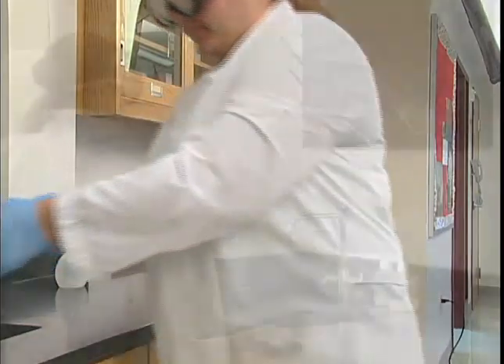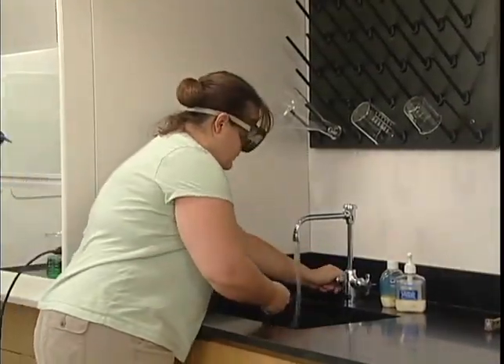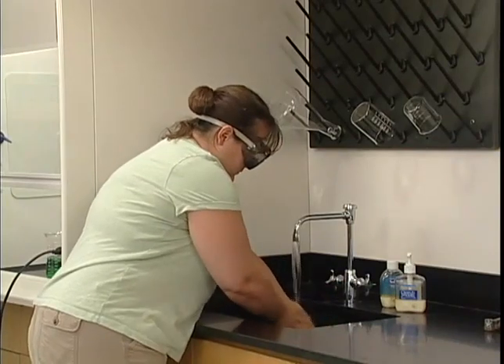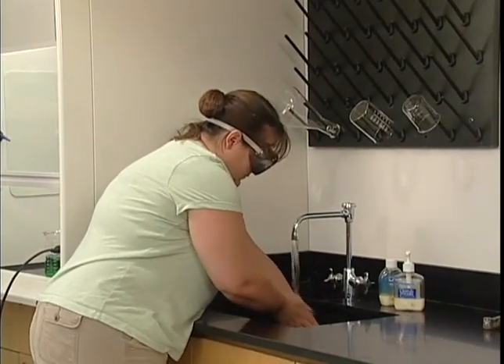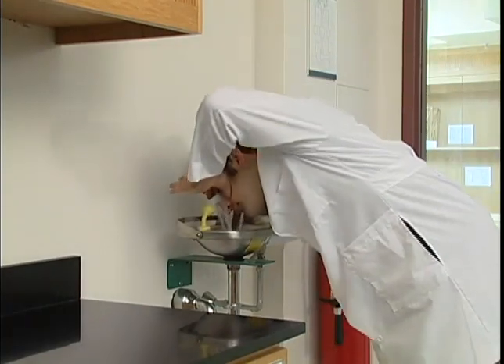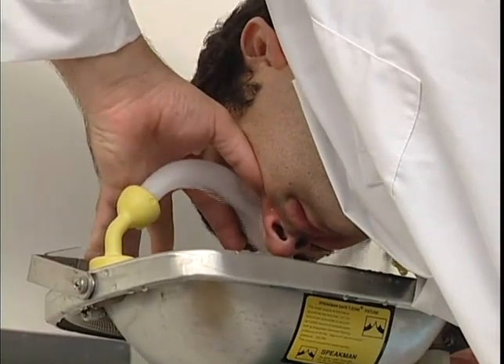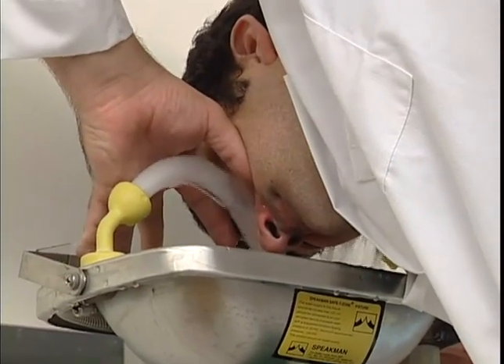For example, first aid instructions for skin contact might be: remove contaminated clothing, wash skin with soap and water, get medical attention. If the material gets into your eyes, you might be instructed to immediately flush eyes with plenty of water for at least 15 minutes. Get immediate medical attention.